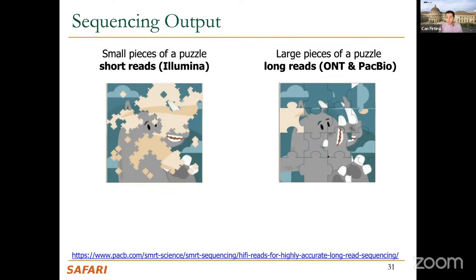I forgot to put this paper here, but we have a paper about this. Once you make these random decisions, this actually affects your downstream analysis. The paper is from 2016, and the title is "On Genomic Repeats and Reproducibility" by myself, Can Firtina and Can Alkan, which was published in Bioinformatics. You can take a look at this paper to learn how these random decisions affect the analysis in the further steps of genome analysis.